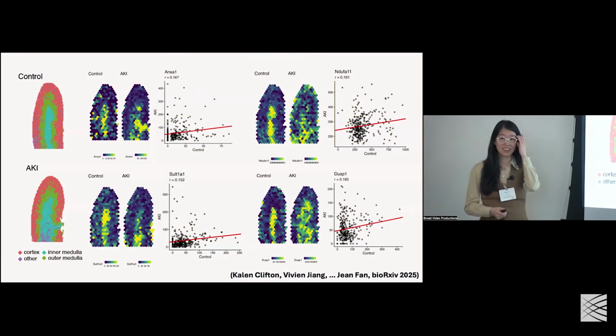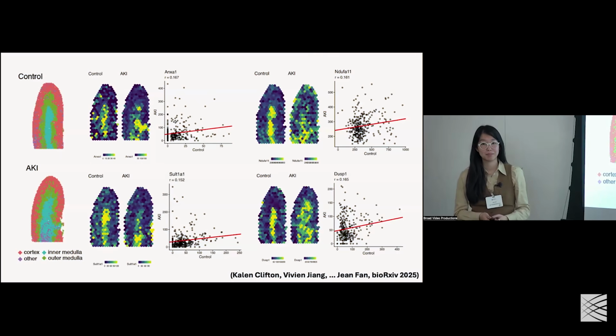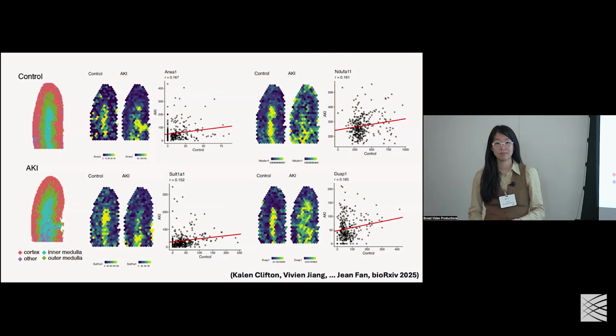It's a great question. I have a question. Very cool approach. How should we think about generalizing similar spatial alignment or registration to tissue samples which are slightly structurally altered? Maybe it helps to assign a tissue-wide coordinate system so that if tissue is a little bit crumpled, or the cell density changed somehow spatially, we could still recover some of these interesting analyses.